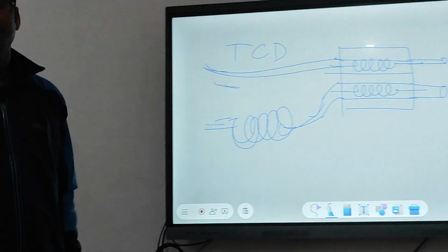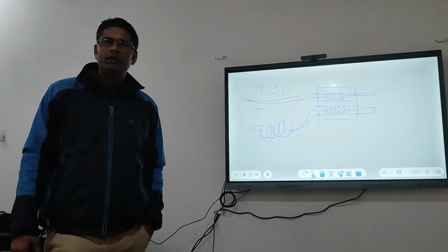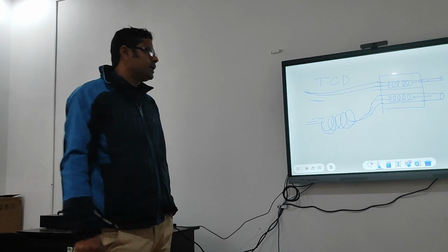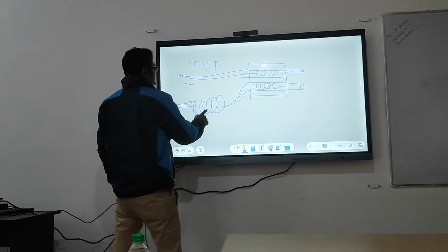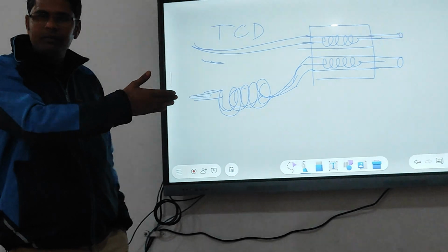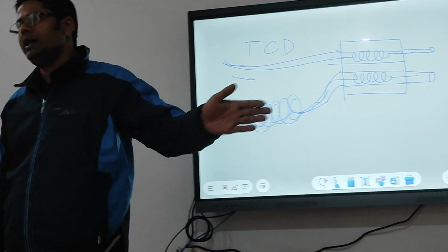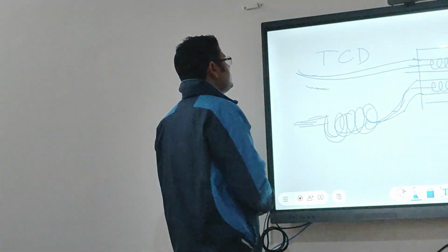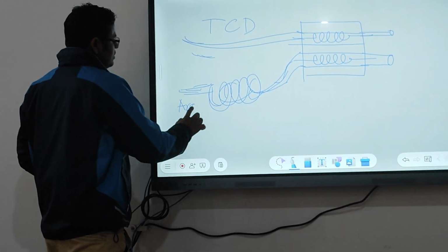You know carrier gas. Without carrier gas, your sample cannot be moved to the detector. That carrier gas will carry your analytes through the column, where they get separated and elute one by one to the detector and then the atmosphere. Here, suppose we are using argon as carrier gas.